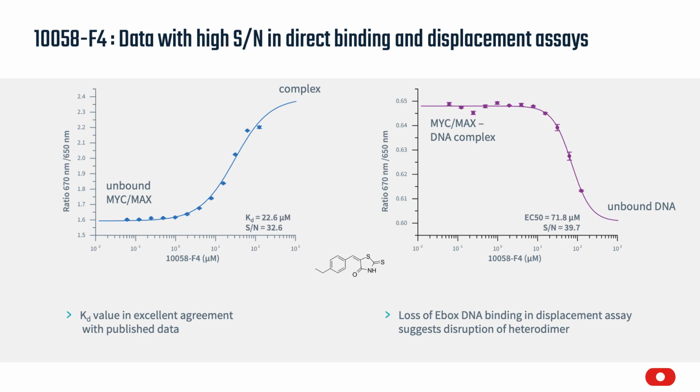So all these small molecules have quite weak affinities. You don't see here any nanomolar binders because there's just no binding pocket on this IDP. It's rather that this molecule has to bind on a large interface on the protein, and that's always hard for these small molecules, so we don't get really tight binding.